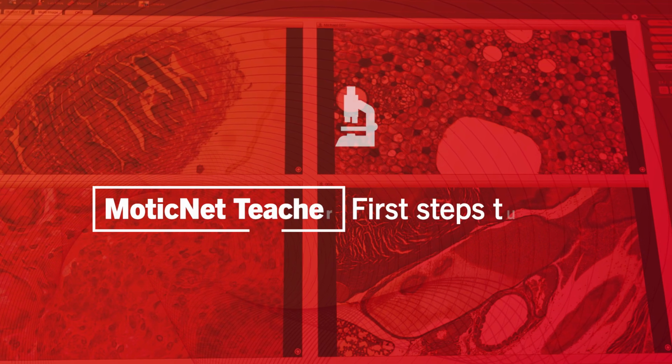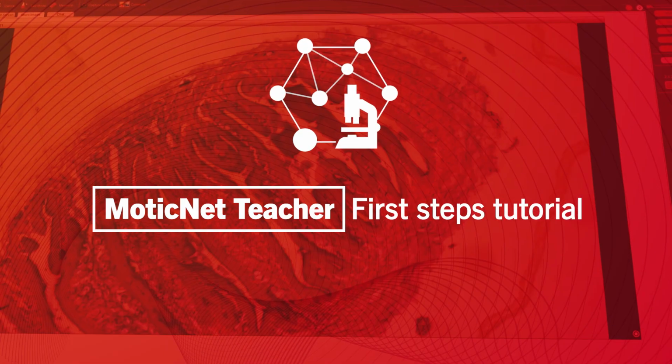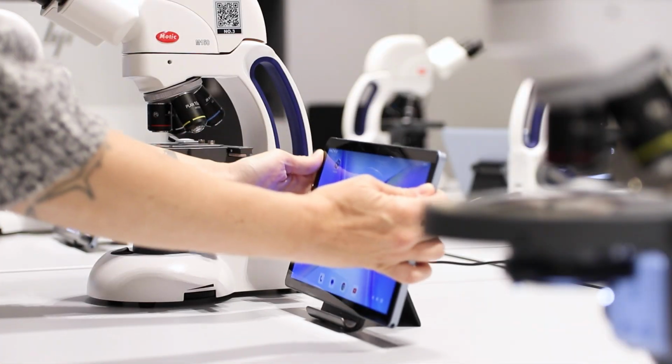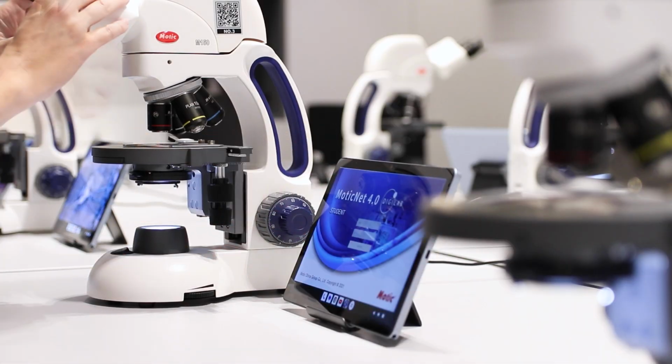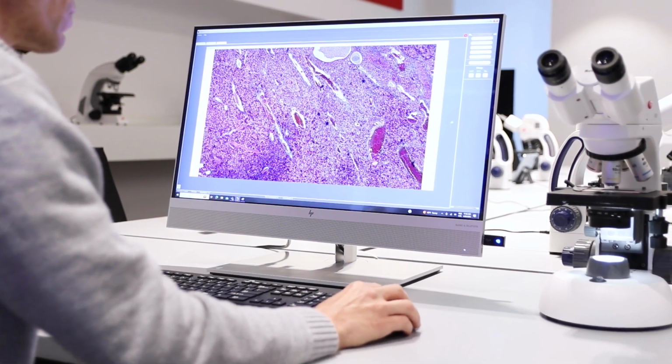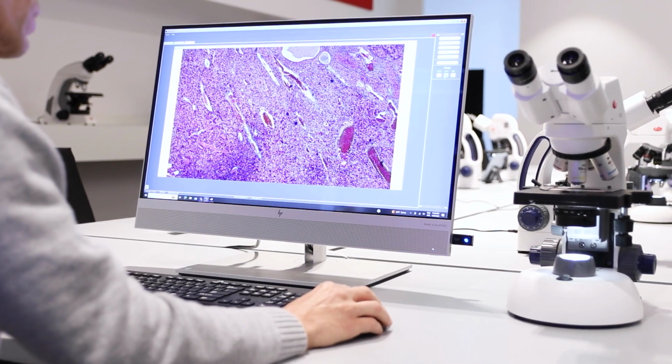In this video, we will show you how to get started with the MoticNet software from a teacher's perspective. Once you have completed the setup, you will learn how to create an interactive class and how to use the main software tools included in MoticNet. Let's get started.